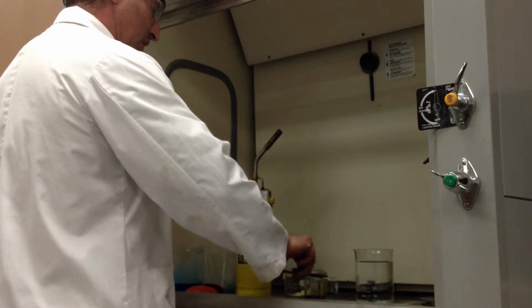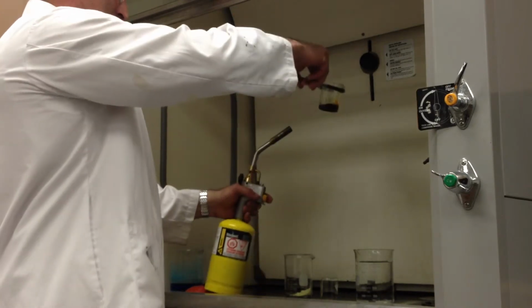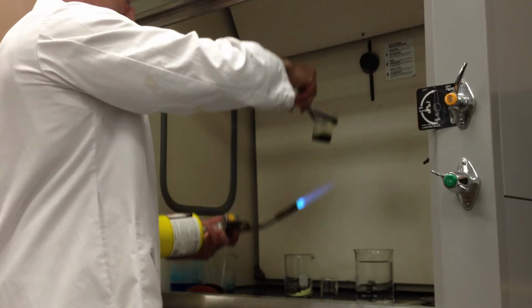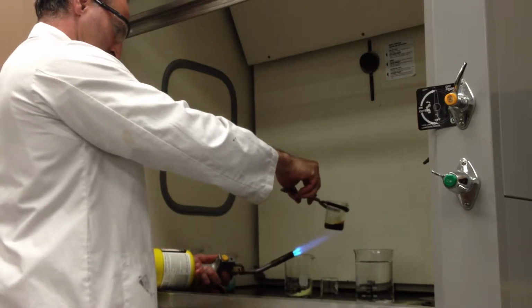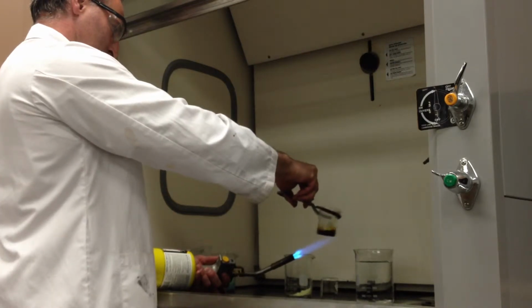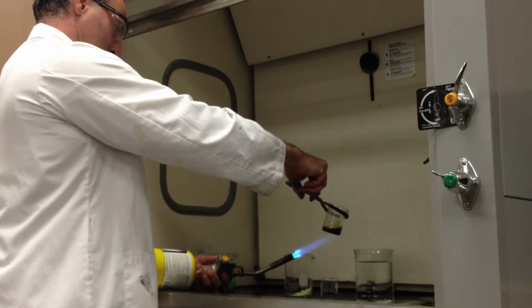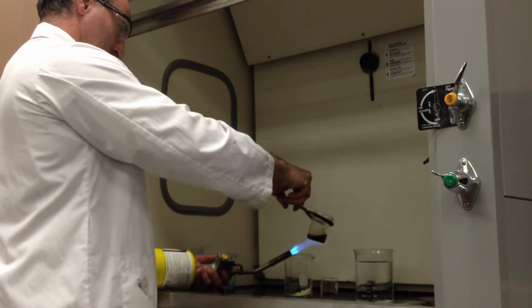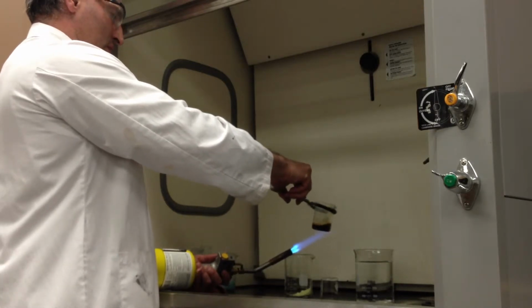its melting point and then cool it rapidly, it forms an amorphous solid so that it remains plastic. We're going to cool it rapidly by immersing it in water.